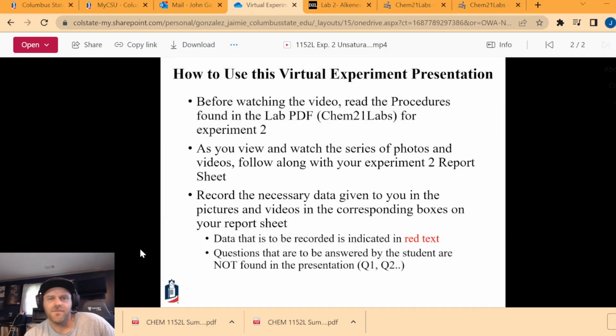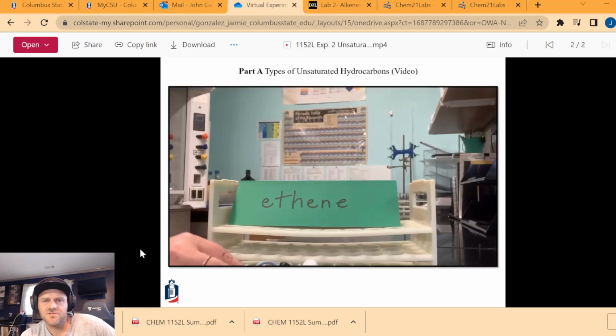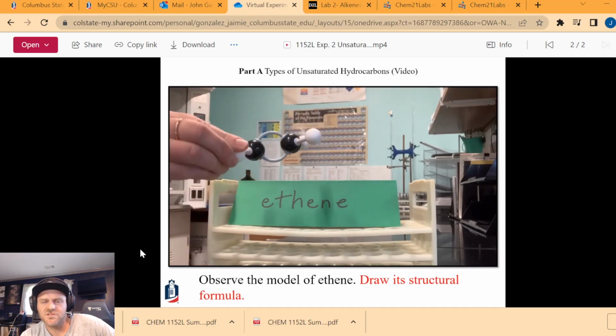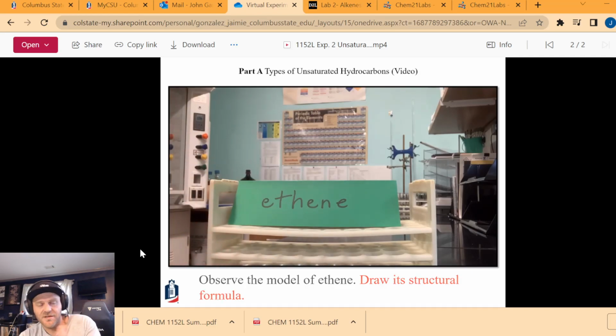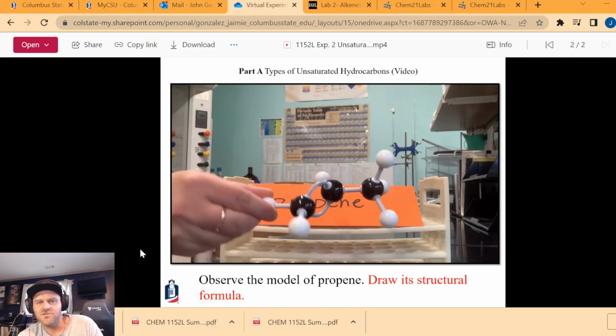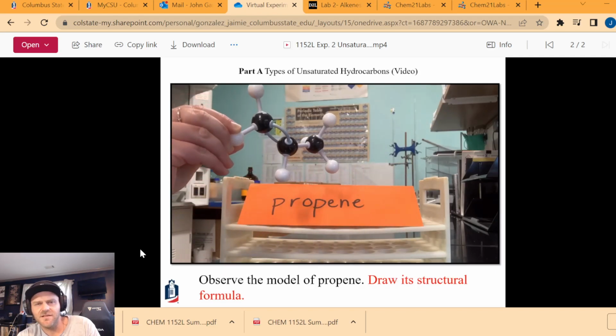So I'm going to go ahead and jump in here. The tests are both on this video. The bromine and the permanganate test are also here, so just stay tuned or skip to those portions of the video if that's all you need to see here. But Jamie does the models of each molecule. You'll see there the double bond. That's how we represent the double bond in these molecular models.